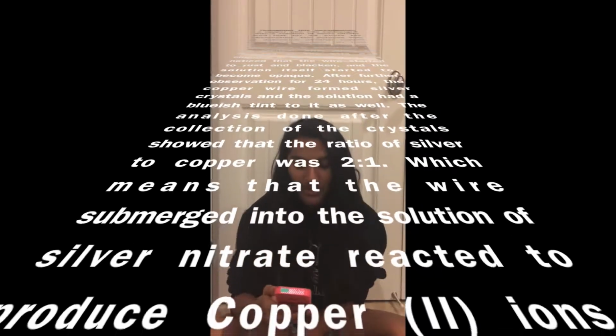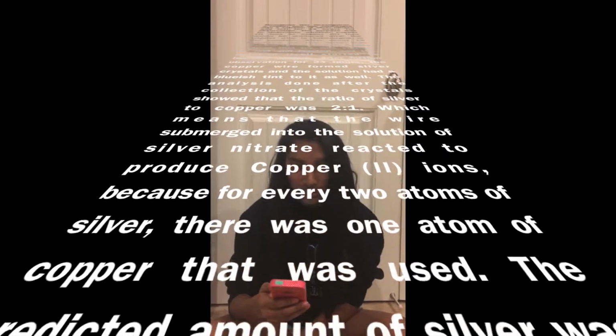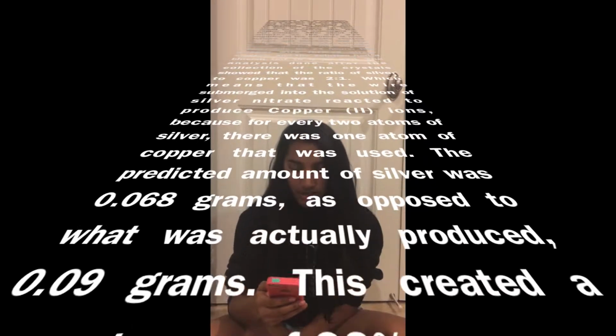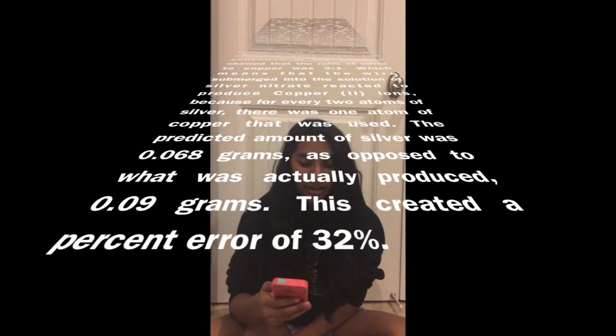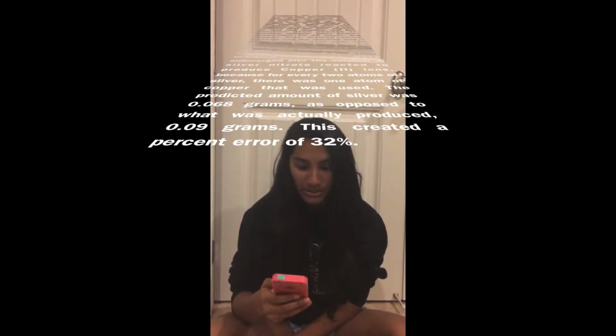And after further observation for 24 hours, the copper wire formed silver crystals and the solution had a bluish tint to it as well. The analysis done after the collection of crystals showed that the ratio of silver to copper was 2:1, which means that the wire submerged in the solution of silver nitrate reacted to produce copper 2 ions because for every 2 atoms of silver, there was 1 atom of copper that was used. The predicted amount of silver was 0.068 grams as opposed to what was actually produced, 0.09 grams. This created a percent error of 32%.